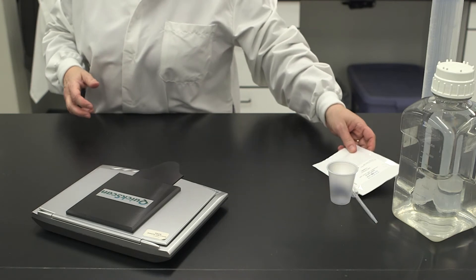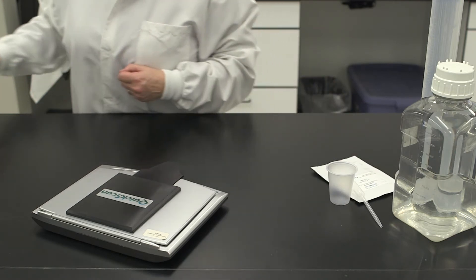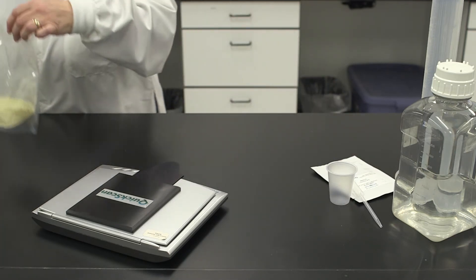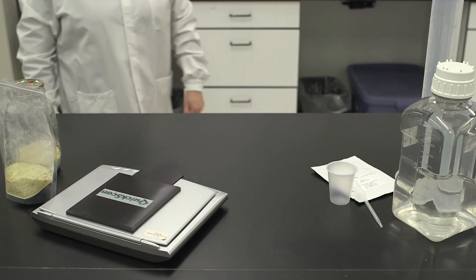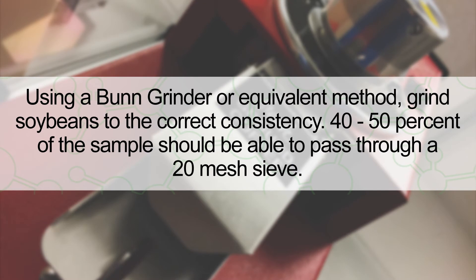Allow your test kit to come to room temperature. Determine the desired sample weight and grinding method as outlined in the product insert. Grind soybeans to the correct consistency — 40 to 50 percent of the sample should be able to pass through a 20 mesh sieve. The product insert gives grind times for various grinding methods.